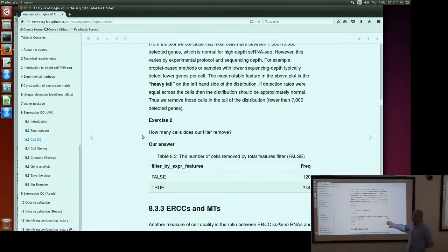So to me, this is also fine. So if you remove 10 to 20% of the cells, it should be fine. Don't be afraid of doing that, because then your downstream analysis would be much more robust, and you will get more biological signal instead of some noise.